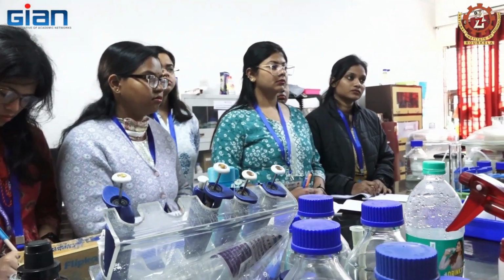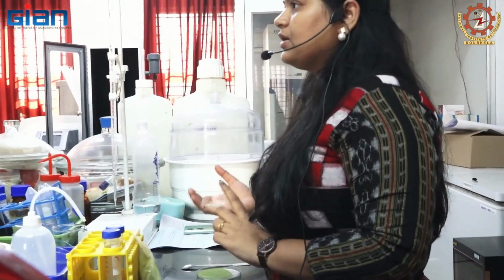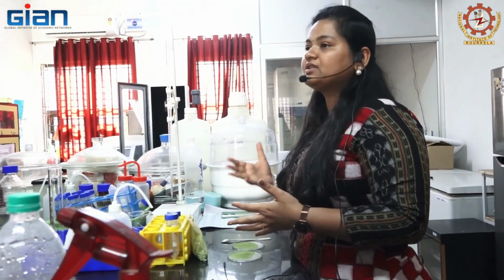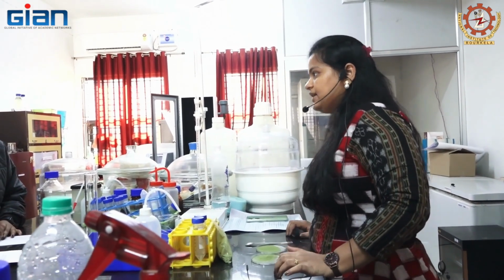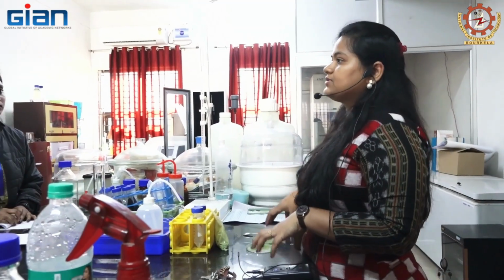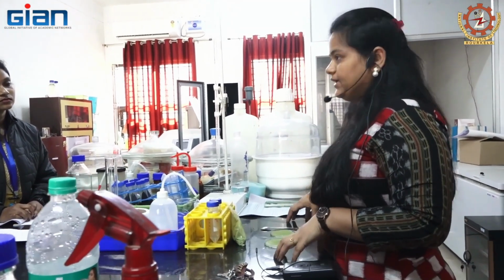After moving on to that, external force is realized into mechanical forces like ultrasound, microwave, high pressures, pulse electric fields, pulse light, everything at the innovative extraction process, which is known as the innovating or emerging technology for the extraction. Today's session is basically for the extraction of bioactive compounds using ultrasound as well as microwave.